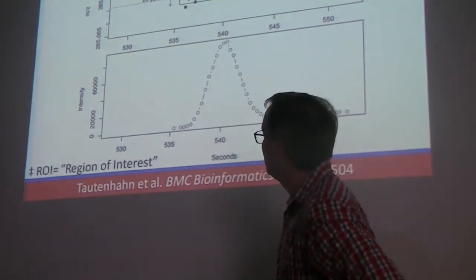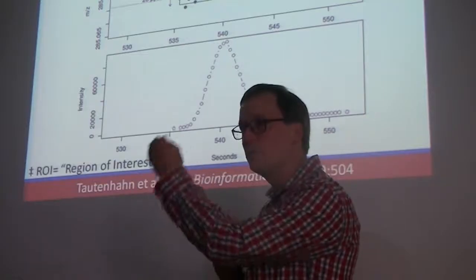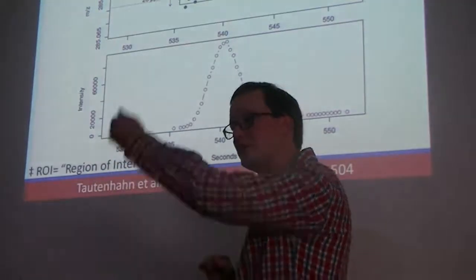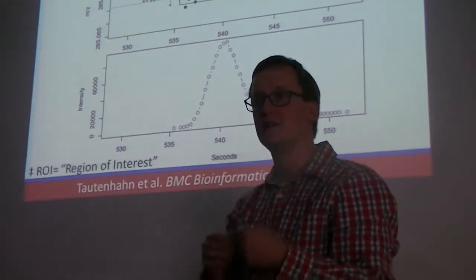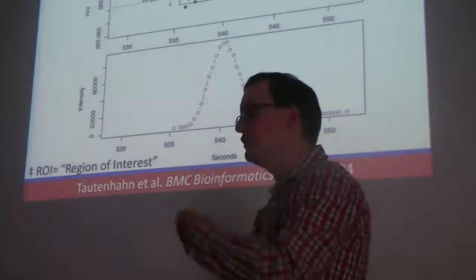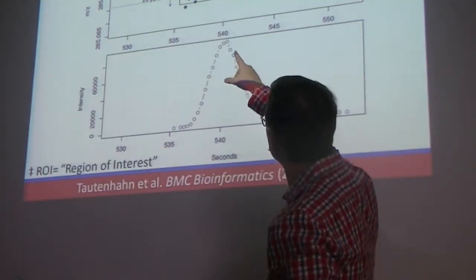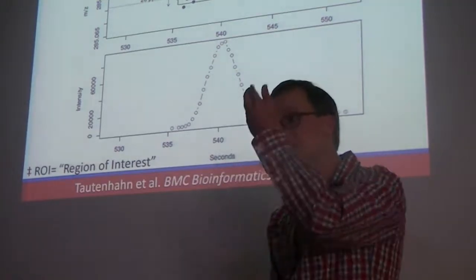If you look at this on another axis, though, up the top, you can see that our measurements have some amount of drift back and forth on m/z value. This is the mass to charge ratio that the instrument is reporting for this ion. So you can see that it's reasonably tight when we get into the middle of the peak at the most intense signal.